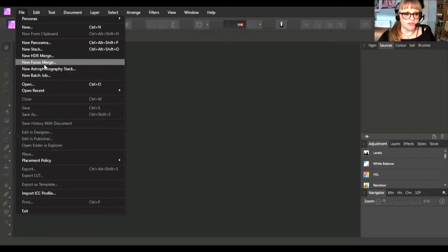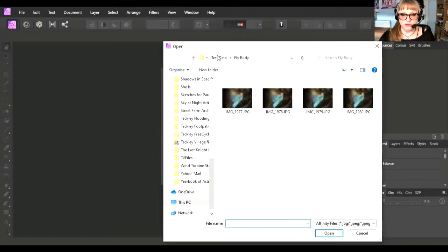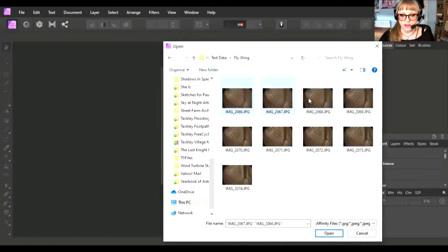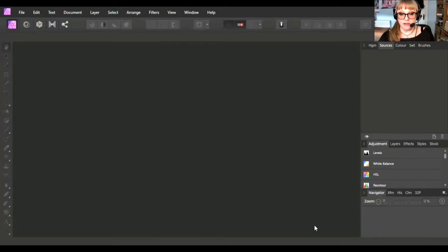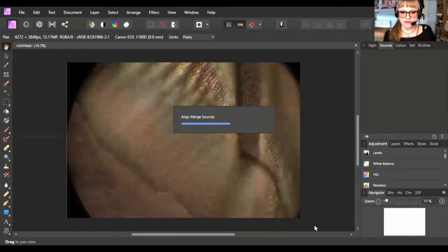At the top in Affinity, if you go up to file and do new focus merge, then you can choose the photographs that you want to do. I've got some test data ready here. This is the wing of a green bottle fly. If I just open these photographs - this isn't a lot of pictures here but it gave a really good result. It's got all of those there and then you click okay, and then the magic just kind of happens. You don't have to do any of the blending or layer masking yourself or anything like that. I've tried doing this manually in Photoshop and I always end up with stripes.